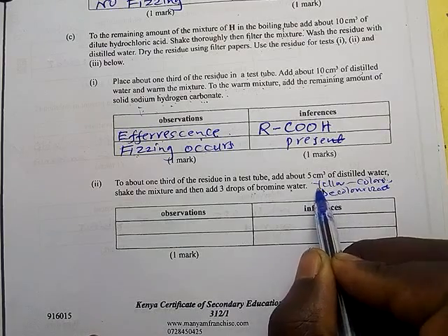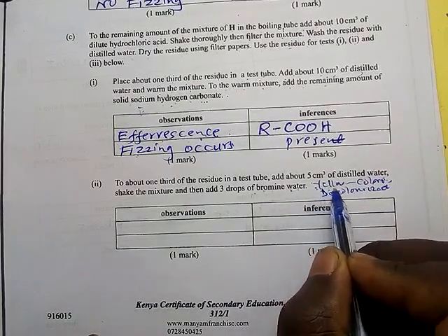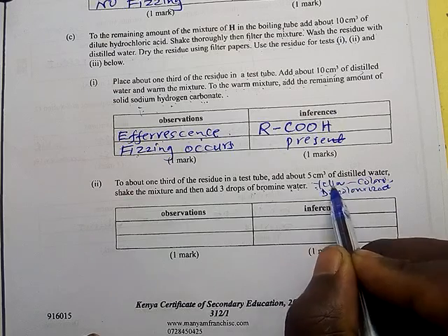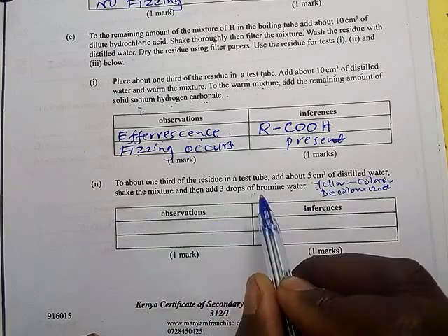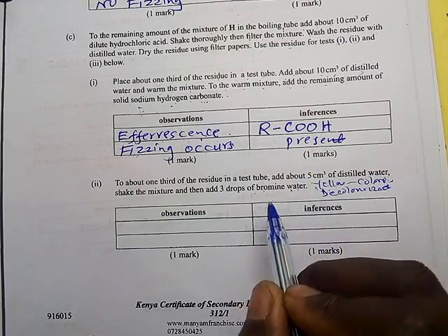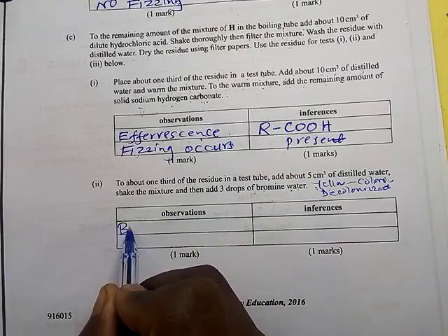So when bromine, which is yellow, changes to colorless, we say that bromine has been decolorized. If it is not decolorized, then the yellow color of bromine is retained, remains yellow.